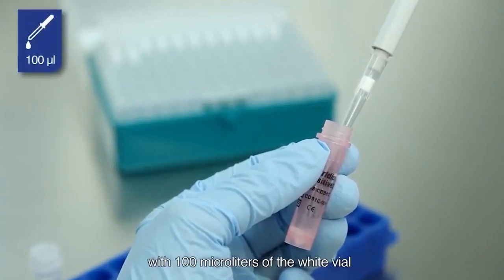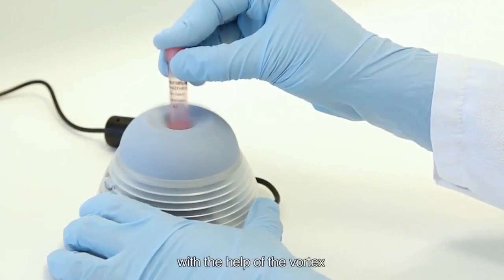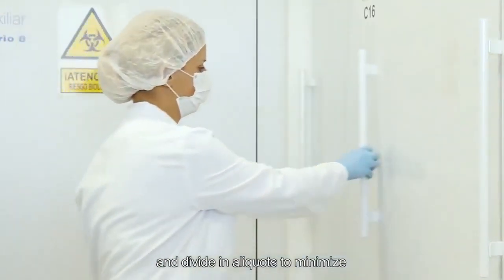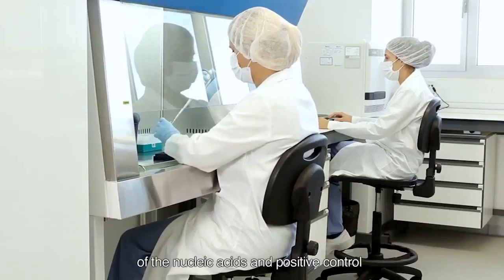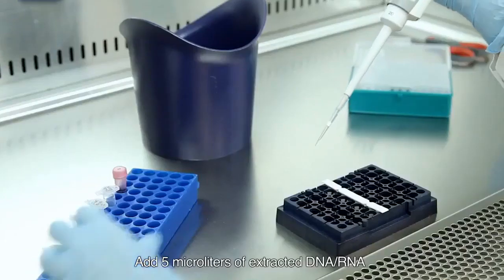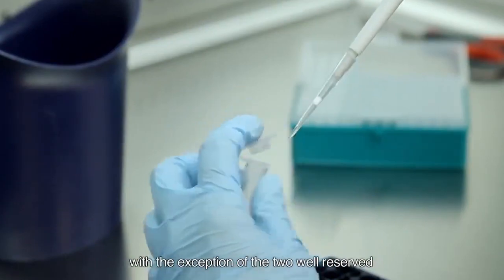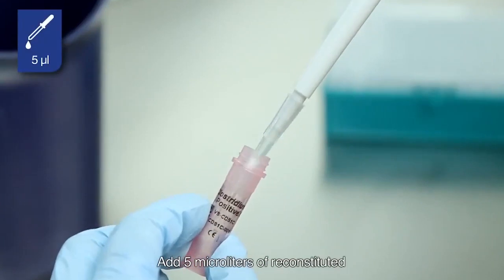Separate the required number of wells, including samples and 2 reserved wells for the positive and negative controls that must always be included in each assay. If necessary, cut the required number of wells with the scissors and remove the protective aluminium seal. Reconstitute each one of the wells with 15 microliters of the blue vial rehydration buffer. Finally, add 5 microliters of the purple vial negative control in the reserved well for negative control. After this process, move the rehydrated wells to the next area.